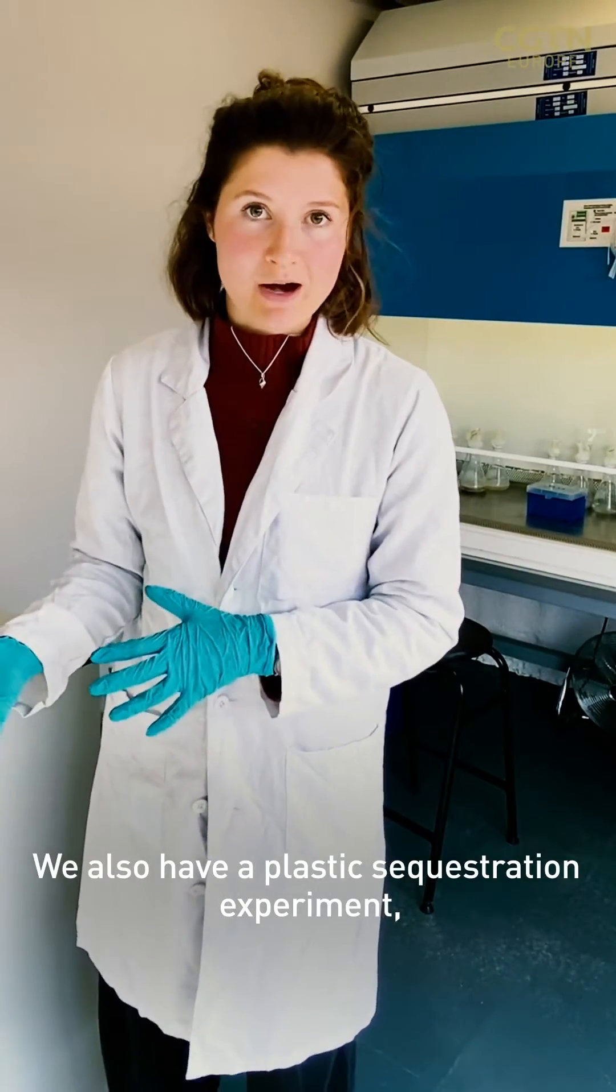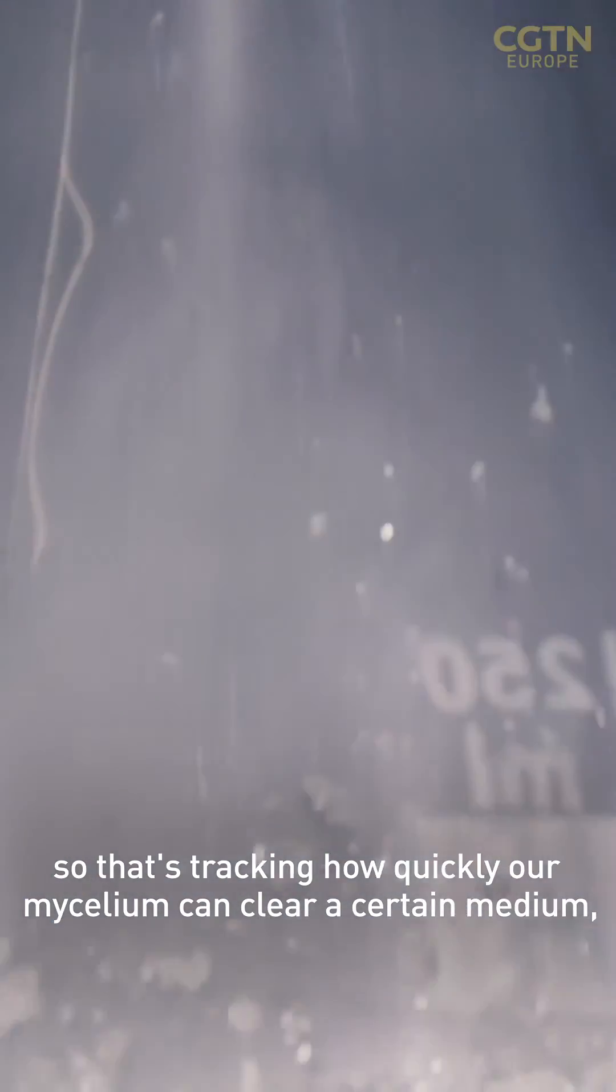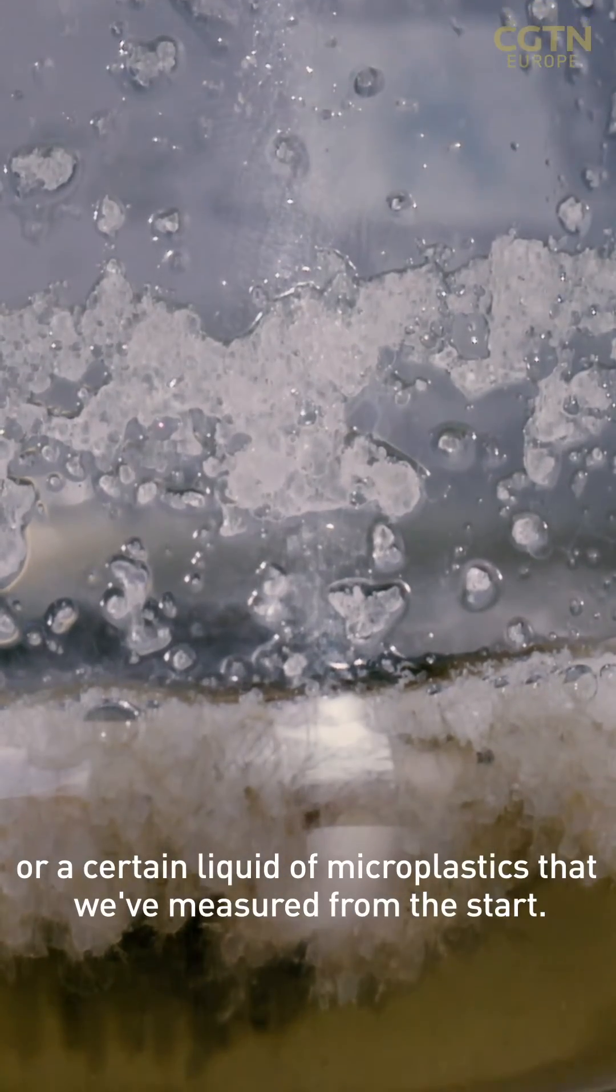We also have a plastic sequestration experiment, so that's tracking how quickly our mycelium can clear a certain medium or certain liquid of microplastics that we've measured from the start.